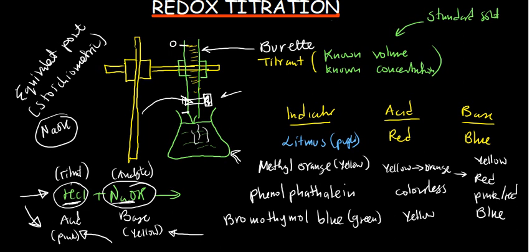Take note of that. Again, hydrochloric acid might not be advised for you to use in the burette either. Why? Because when you're adding the hydrochloric acid and it spills on you, it is so corrosive, it's going to burn your skin. Also, when you're working with this, make sure that you clamp the stand at your own height.